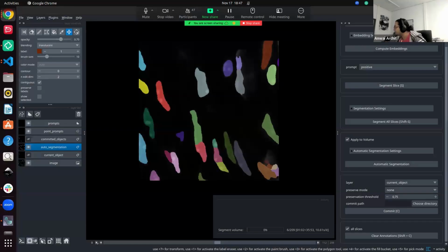So let's say the idea would be you have a model which does a very good job for, let's say, interactive segmentation. You got interactive segmentations for it, but for automatic segmentation, it's a bit poor. And let's say in daily lives, we do not have GPUs at hand. And we want to train these models fast on low resources by, let's say, still watching a YouTube video, for example. And then over here, the idea is opening up resource efficient or parameter efficient fine tuning, wherein you retrain the model on your data to make it more knowledgeable about your data and do a better job.